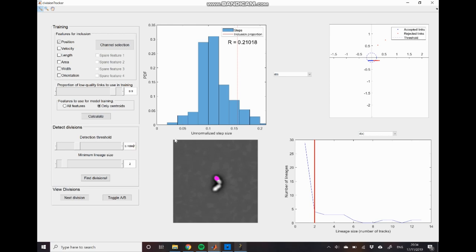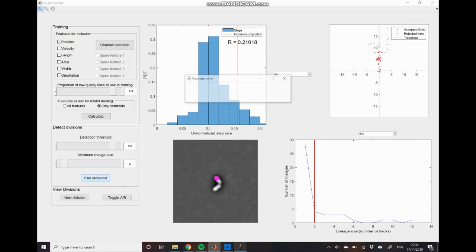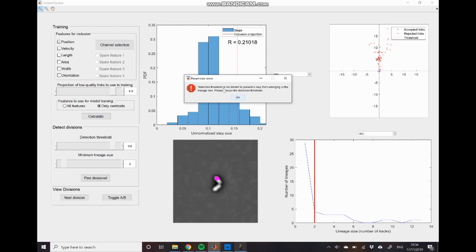So to get around this I will just increase our detection threshold. I'll bring this up to 0.6 and click find divisions. And you can see now that we have this warning appear which is telling us that we've raised that detection threshold too high.